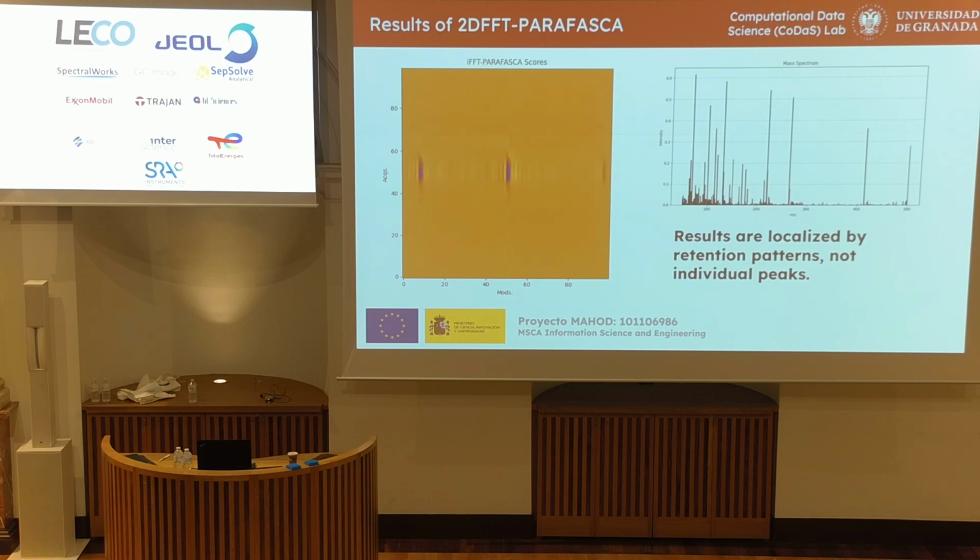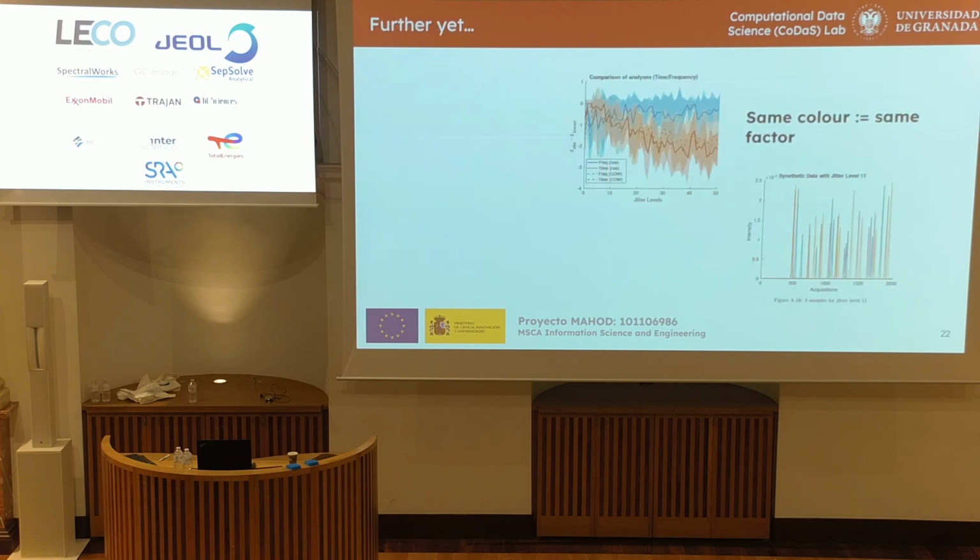And this is just super quickly the results. I don't have a lot of time, but these are the inverse loadings. I was hoping that by adding more components, I could actually get the peaks themselves, but because it incorporates spatial information as part of the imaginary component, we actually get sort of chemical families with similar retention times in the first and second dimension, or sort of correlated retention times along the first and second dimension retention time. So this mass spectrum is kind of useless, but you can zoom in on peaks that are significant and then extract the mass spectra that way.